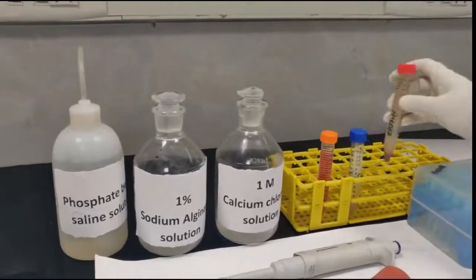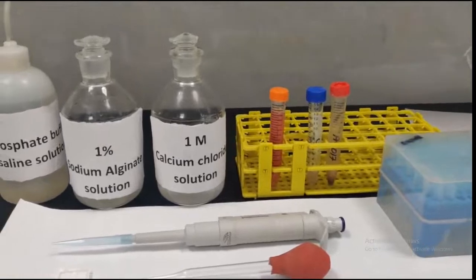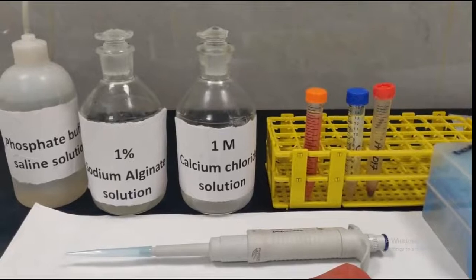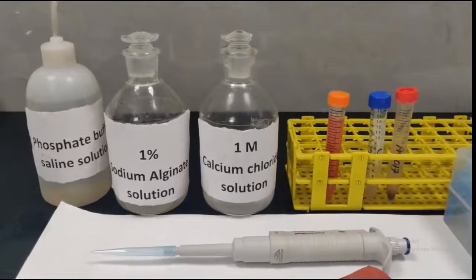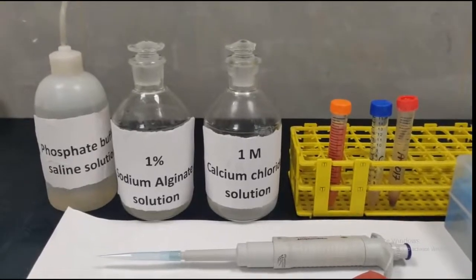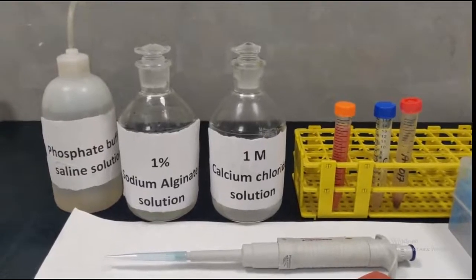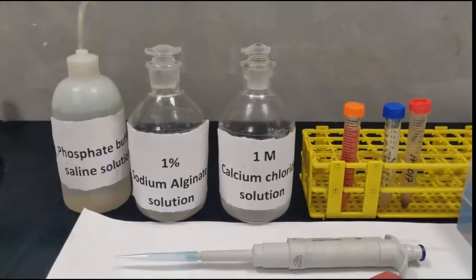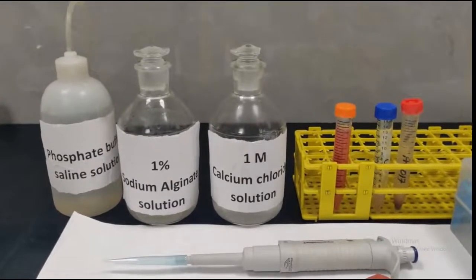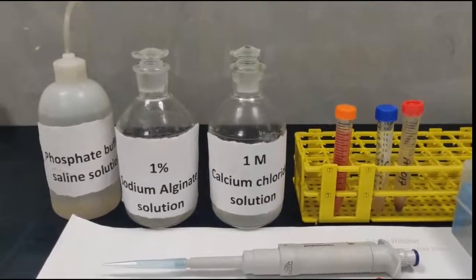So for the next step, we require two solutions. As the name suggests, the name of this technique is the sodium alginate technique. So the first solution is the 1% sodium alginate solution that has been prepared in the laboratory using the sodium alginate powder, and we prepare 50 ml of sodium alginate stock solution, 1%, and this can be used for a period of 3 months. This can be stored at room temperature. Similarly, 1 molar calcium chloride solution is prepared, and this can also be stored at room temperature.